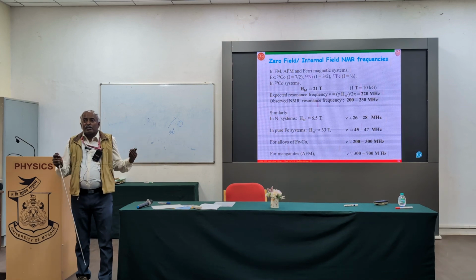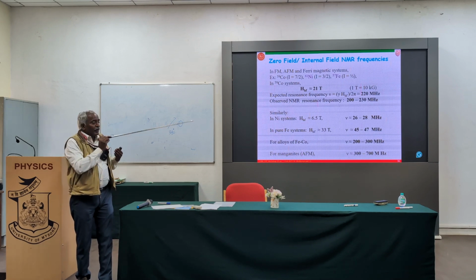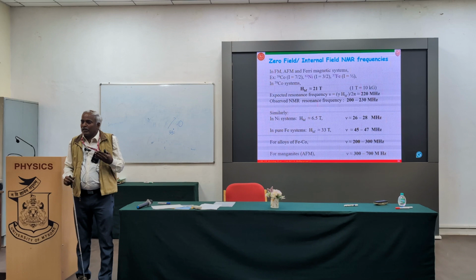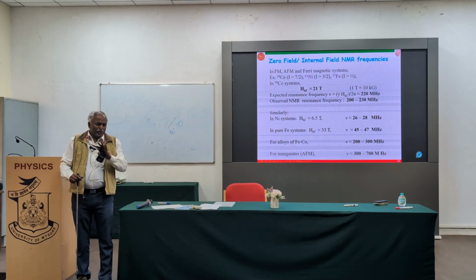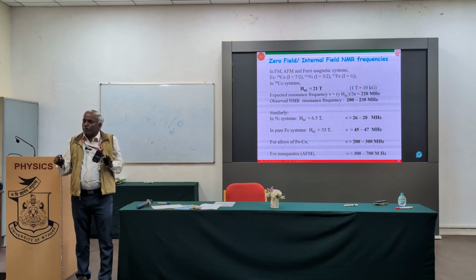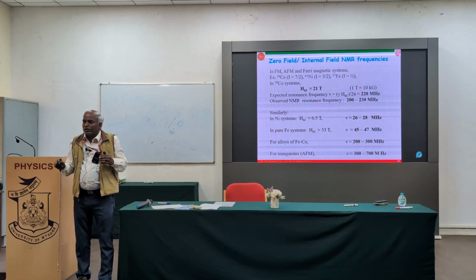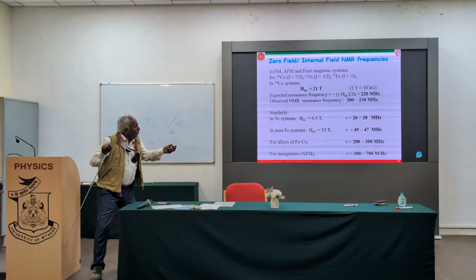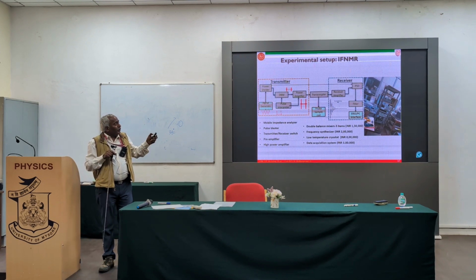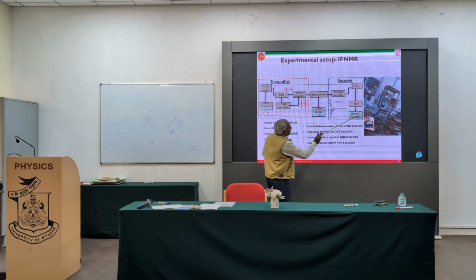And also, I have to construct my LCR resonance circuit, right? It has to match 700 megahertz if I want to measure the signal. The basic LCR concept: I have to choose it in such a way that resonance happens, with minimum impedance, and then only I get maximum current that will detect the signal properly.